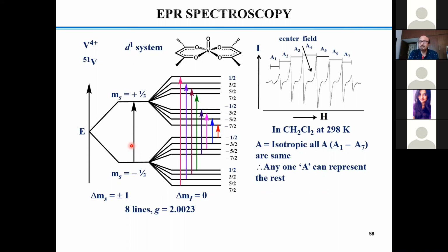That is why it is considered to be one of the standard molecules to show the ESR spectrum to the students. So here you can see the vanadium in the +4 state, okay, and not necessarily it is pentacoordinated. You will have one solvent over here, the coordinating solvent most likely water. Water is there, but that won't contribute towards your EPR profile naturally.